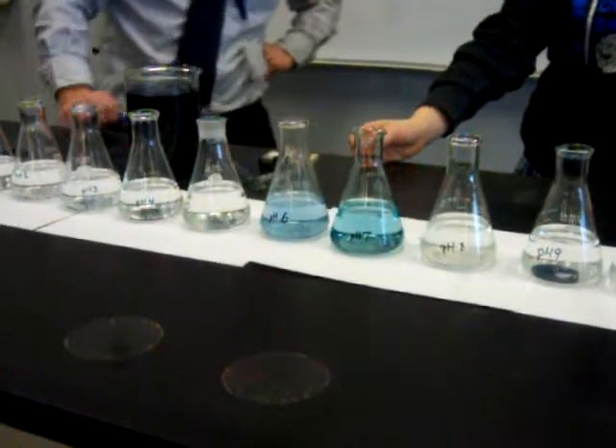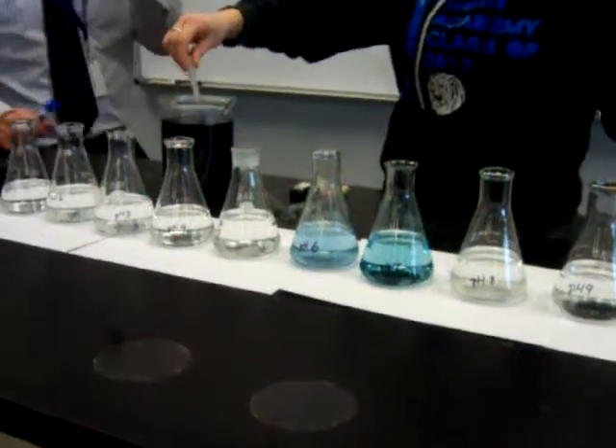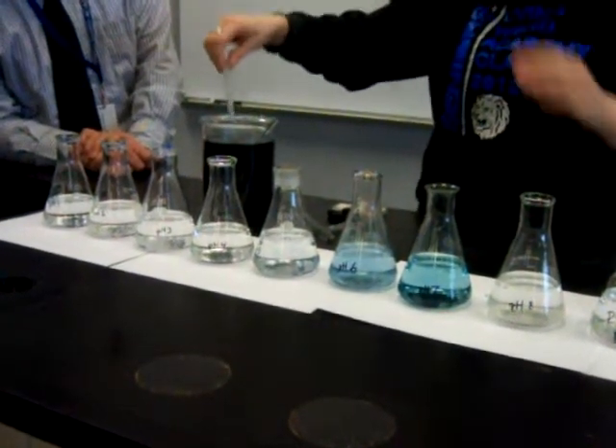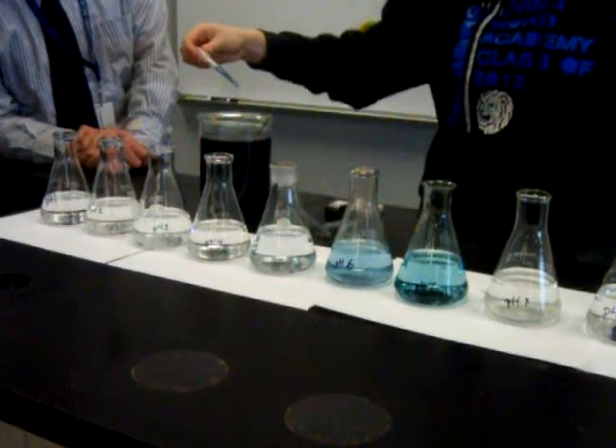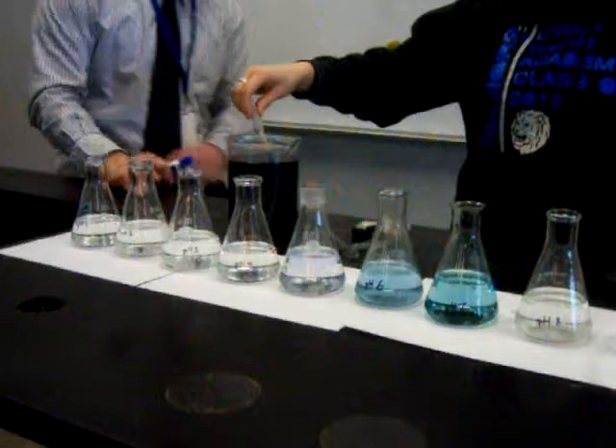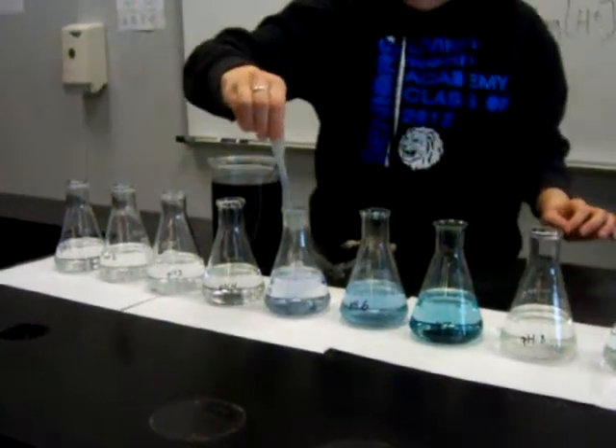Cabbage is not the only kind, so keep going down the line. It's not the only substance — it's strawberries, beets, and a lot of other things that have similar natural indicators in them. Has anyone ever heard of litmus paper?